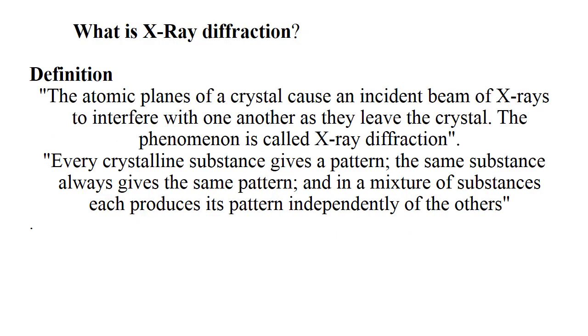What is X-ray diffraction? We have discussed this previously in the lecture. This is the only method to directly determine the structure of crystalline molecules, and we have already discussed that this phenomenon is not applicable to amorphous solids. When the X-ray beam strikes crystalline material, the diffracted rays spread in various directions.